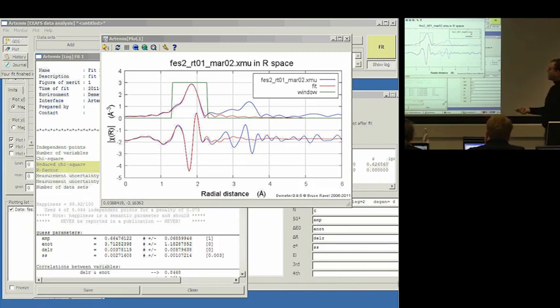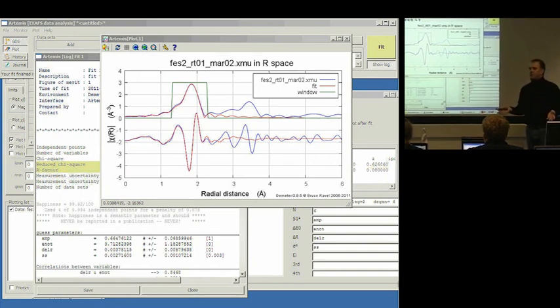So we got reasonable values, except for one that's a little bit low. We mostly got reasonable numbers for the parameters, and we got a reasonable fit. And that's fine and dandy, but there's obviously more to this material.